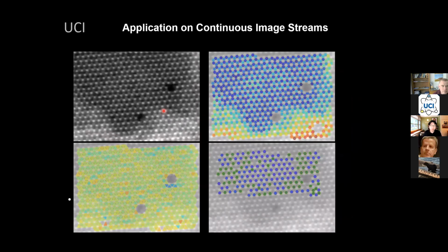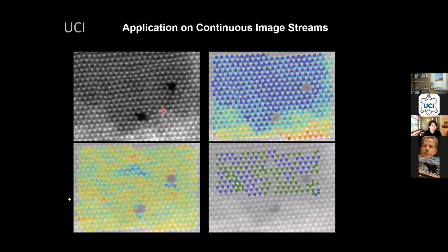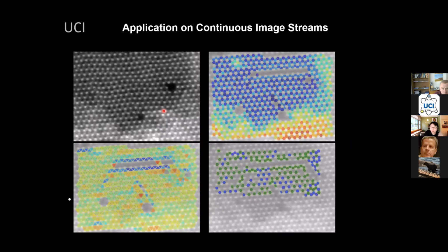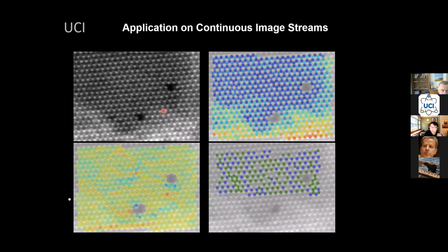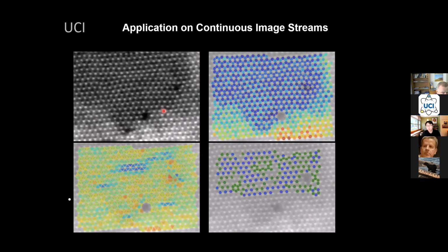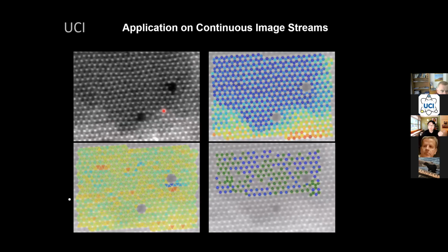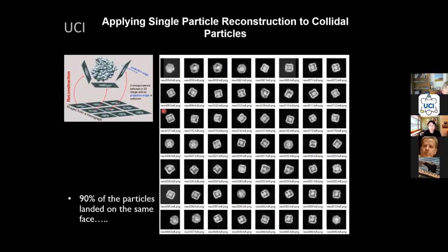So of course, you can process image streams and all that, right? So this is the first example. Just want to show you that by smartly creating ground truth labels, creating a reasonable library, you can actually train your network to perform a lot of things that traditional machine learning algorithms actually fail miserably at. For example, denoising, super resolution processing, and all that.